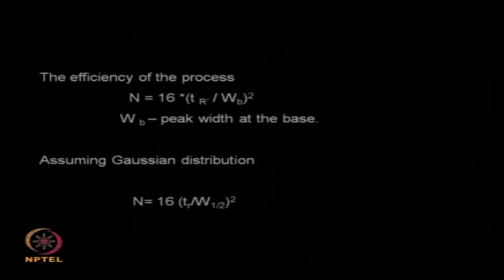Then we also have some equations which tell the efficiency of the process, or the efficiency of your chromatogram.